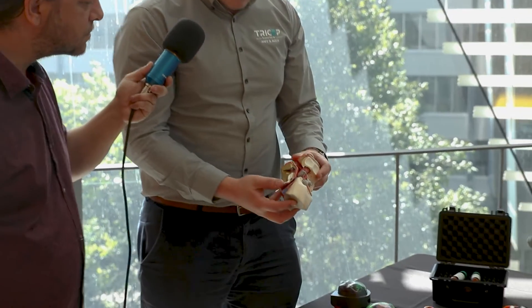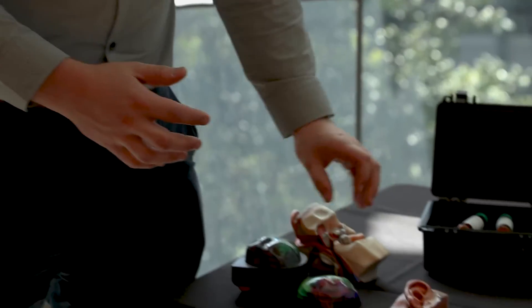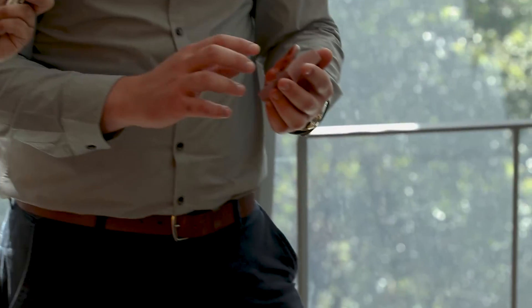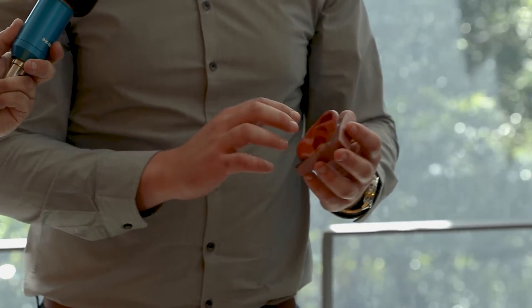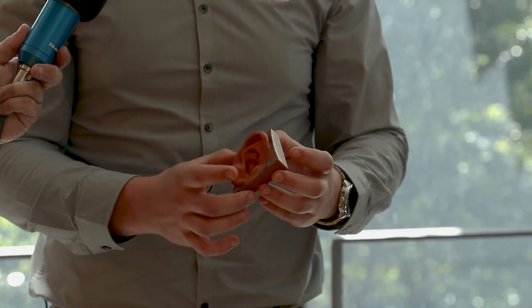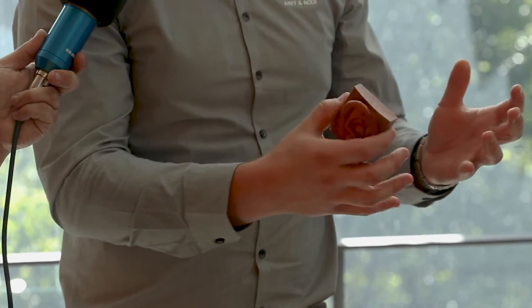So that one is a model we generated. But we've also got this one, which is straight off a 3D scan — we have a couple of 3D scanners where we are. We're able to 3D scan the ear, take the STL, and show the translation from scan data to printed data. We're also able to take that and print silicone structures for prosthetics, working with a prosthetist and surgeon Payal up at RPA, doing prosthetic work as well as cartilage regeneration.